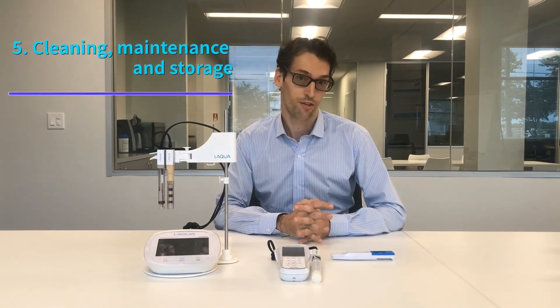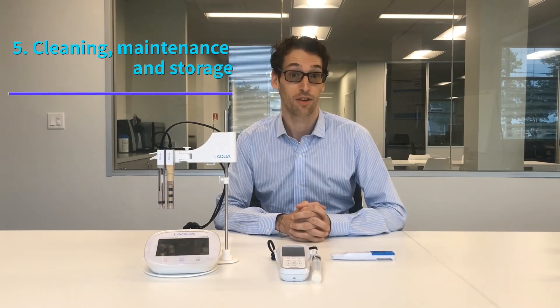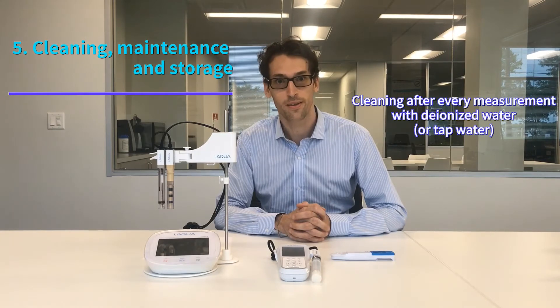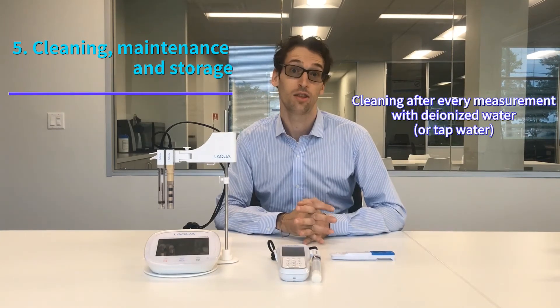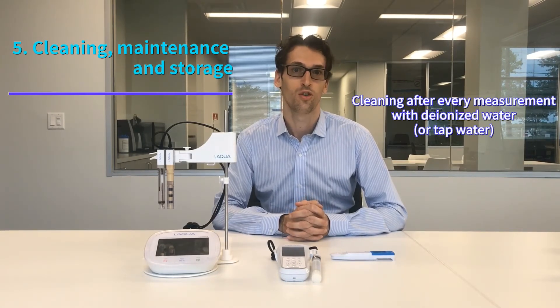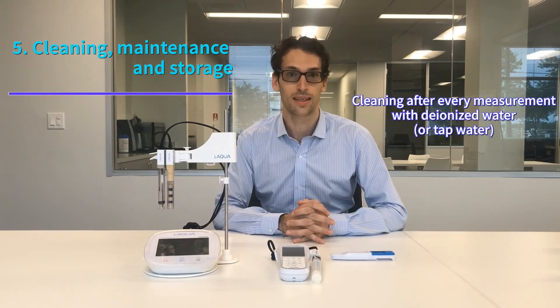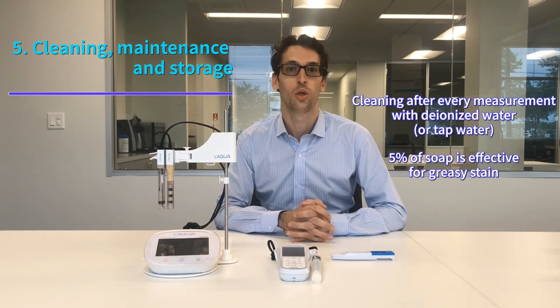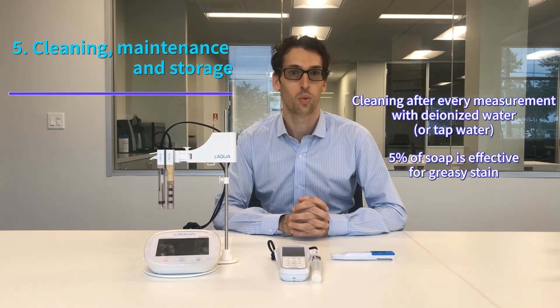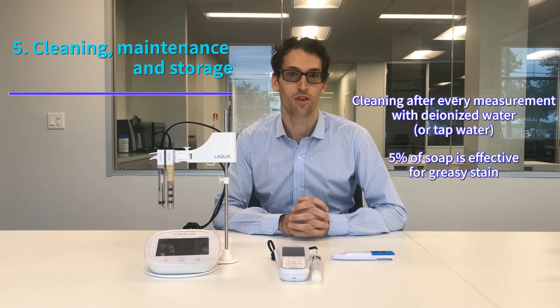Finally, cleaning, maintenance, and storage are important. For cleaning, we recommend doing it after every measurement. You can use tap water, though deionized water is better. In case you measure a greasy sample, there is a risk of grease remaining on the sensor. To avoid this, prepare a cleaning solution with water and 5% soap, leave it on the sensor for about 5 minutes, and then gently clean the surface area with a q-tip. After that, rinse and dry the sensor before storing it.